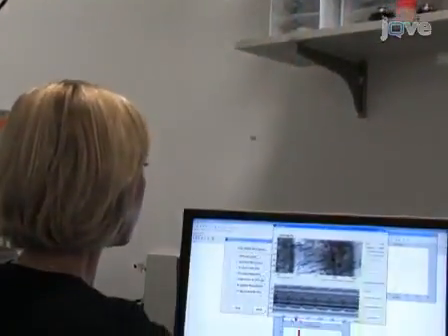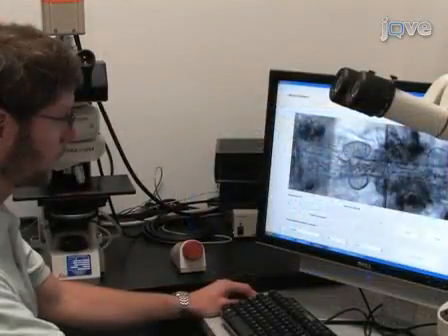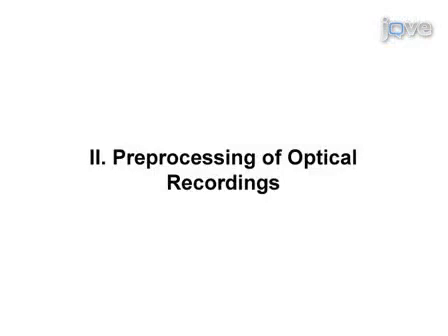We're going to demonstrate our semi-automated heartbeat analysis program for understanding and quantifying heartbeat parameters in model systems with small hearts. This is a high-speed movie of a beating fruit fly heart. Information about heart morphology and contractility can be obtained by measuring heart diameters during contraction and relaxation cycles. To do this, the edges of the heart need to be identified and marked during maximum diastole and systole.